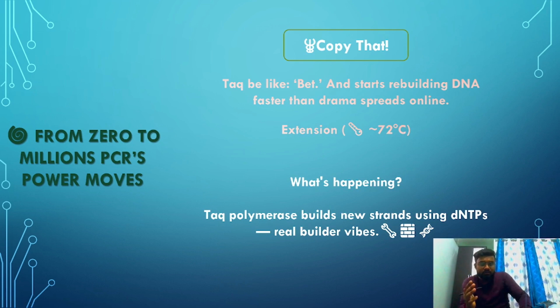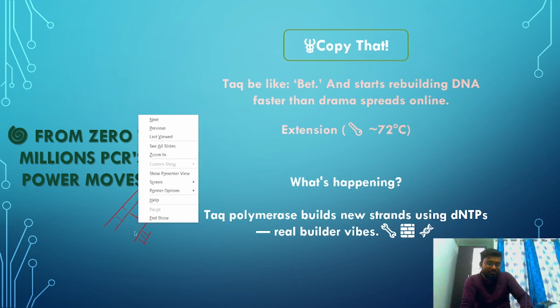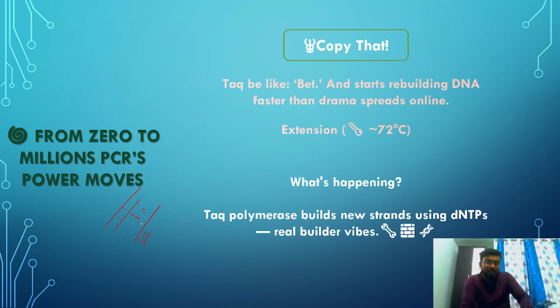Now what is happening here? It was a toxic one, it breaks up, okay, ready to mingle, it's a perfect match. Now, building a relationship needs building blocks, that is the dNTPs, and as you all know, for every relationship the best friend plays a key role. The best friend is Taq polymerase. Taq polymerase comes and continues the reaction. Thus the building blocks slowly add and add. And Taq polymerase releases, meaning once a perfect bond comes, the best friend makes an exit.